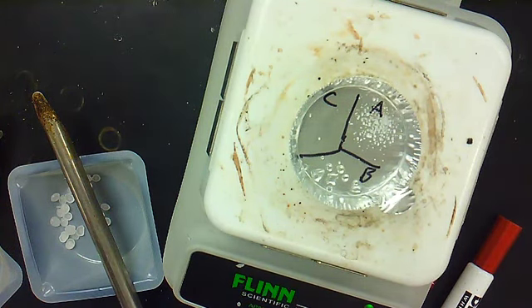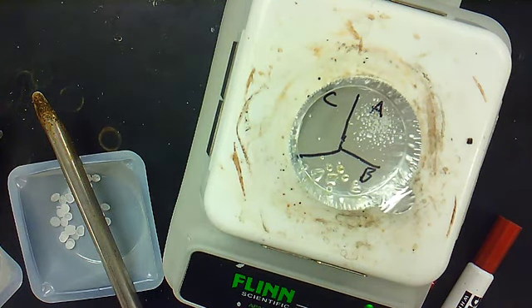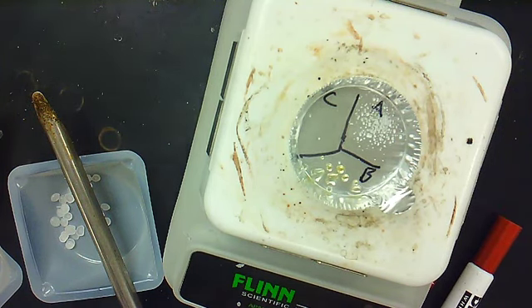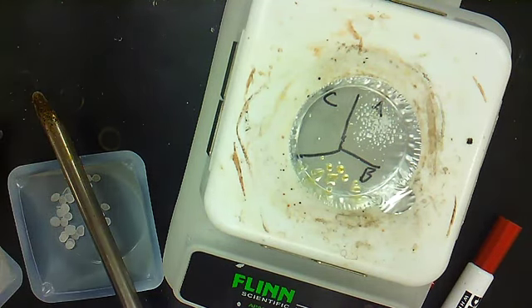So you should be seeing a phase change in one of them. I'll wait till it's super obvious. Okay. And let it do what it did yesterday. I'm going to go ahead and turn off my heat because I feel like we can see it. Okay. So you should be able to record your information there.